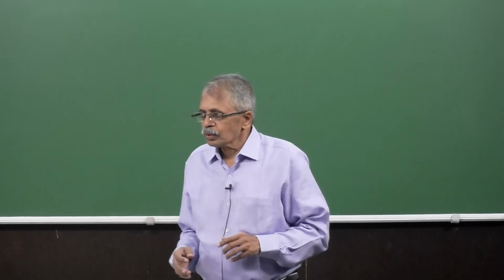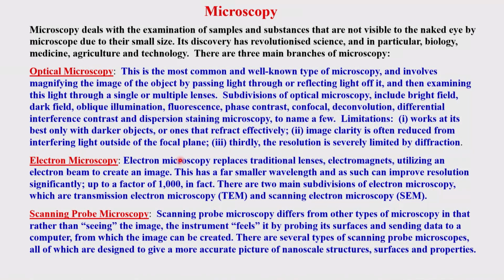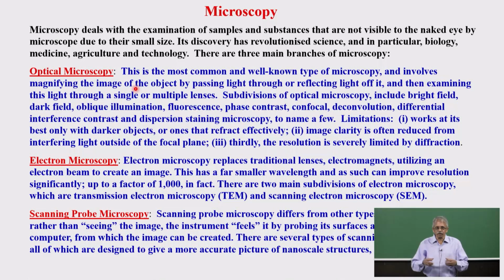Okay, so just to give an introductory aspect, as you can see on this slide, optical microscopy, as is mentioned, uses light and lenses which you have studied in your 7th and 8th standard, where you can make the focals, etc., and then you can use the magnifying lenses as well, with light radiations, basically visible light radiations. So you have an object, visible light, and then the reflected light. You will be focusing and then magnifying and then looking at the image of that. So that's how you can generate the image.